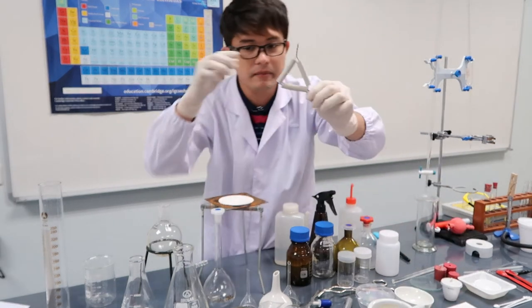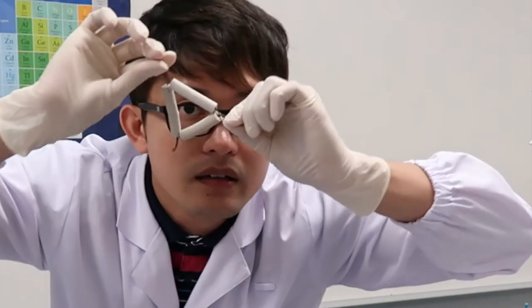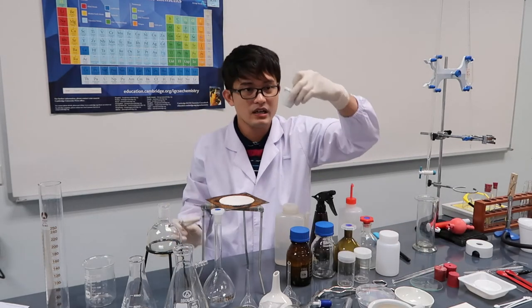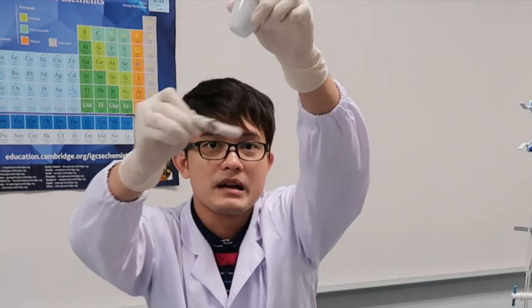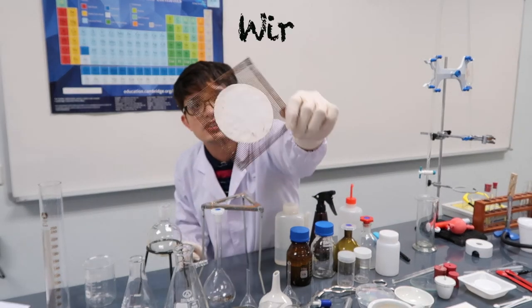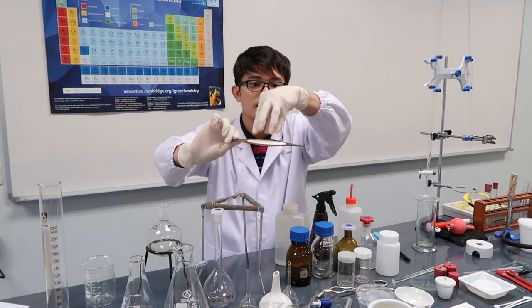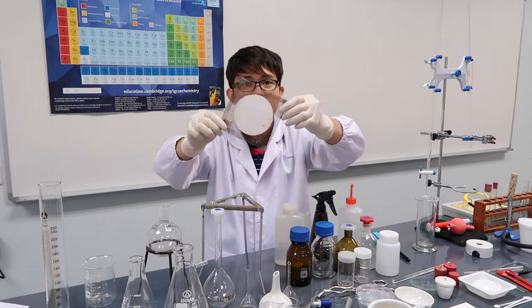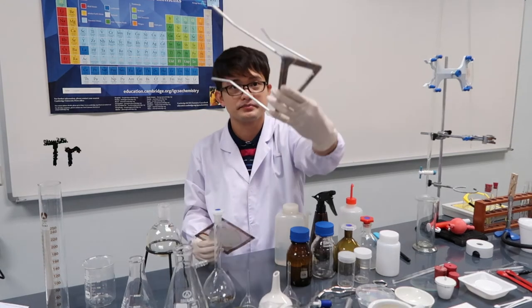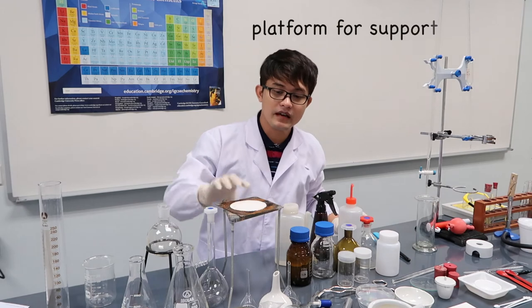This is a pipe clay triangle, used to support the crucible. And this is a tripod — when you place a beaker, conical flask, or evaporating dish on it, the flame from the Bunsen burner below is distributed evenly and homogenously.